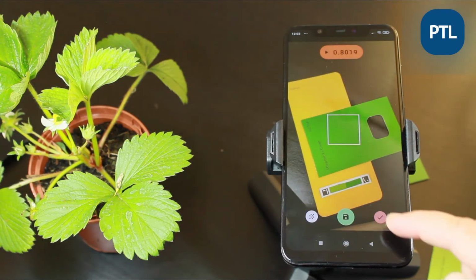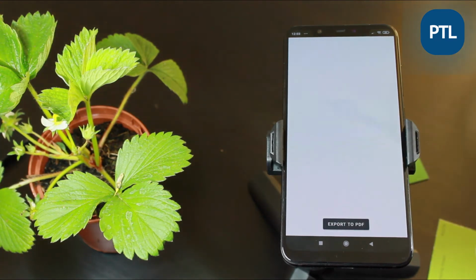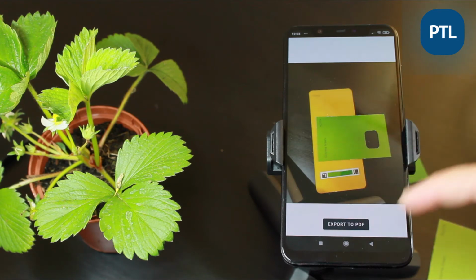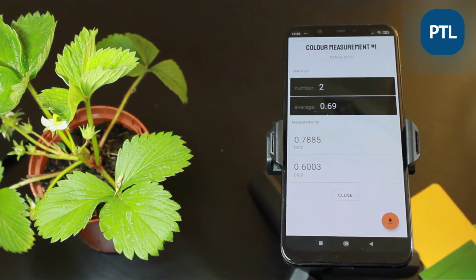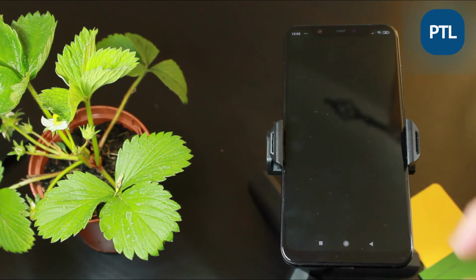Then, if we finish the session, we can see the number of chlorophyll content measurements, the average value, and also can check each of the color measurements in a list. Finally, we can make a PDF file for sharing it with our colleagues.